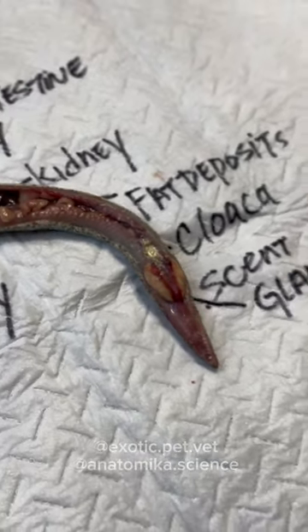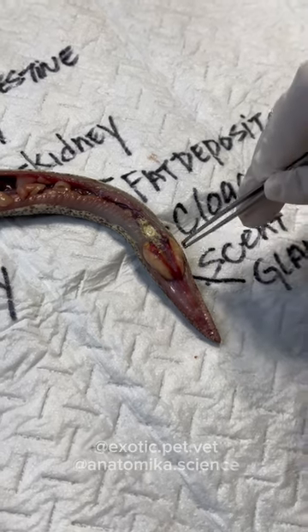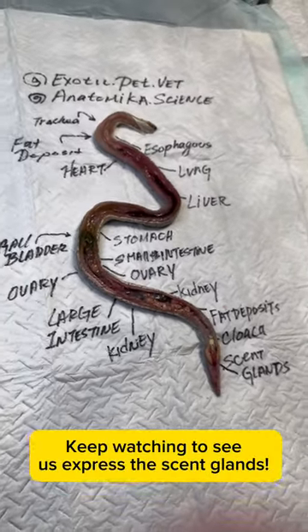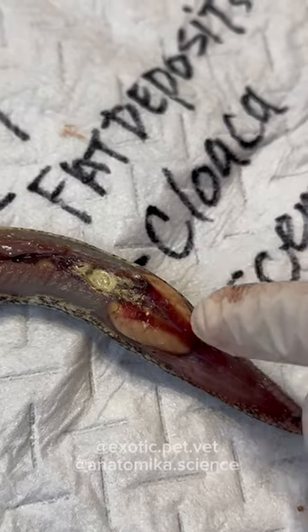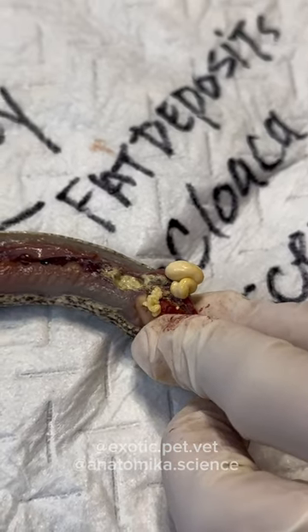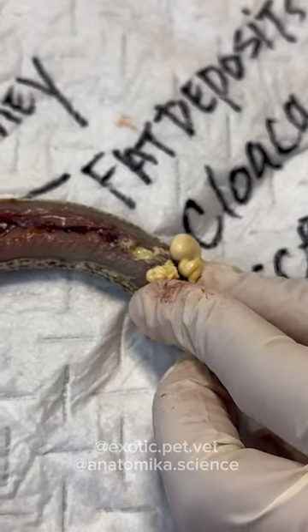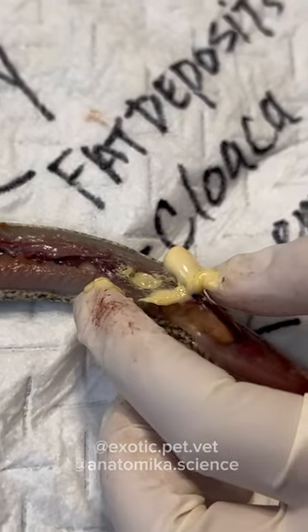In females, the scent glands might be a little bit bigger. Males have hemipenes over them so there's less space — the female ones are longer. We're going to express some scent glands — you can see the red lines are the duct of the scent gland. So if we squish it, you'll see it beading out. Oh, gross. Like crème brûlée. I can never eat crème brûlée again. Oh, that smells.